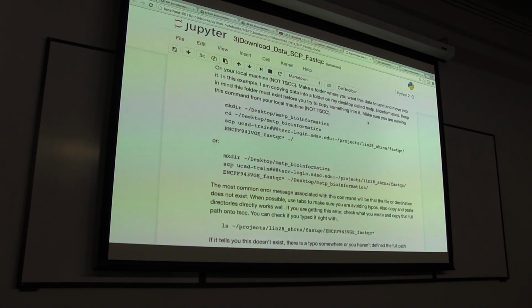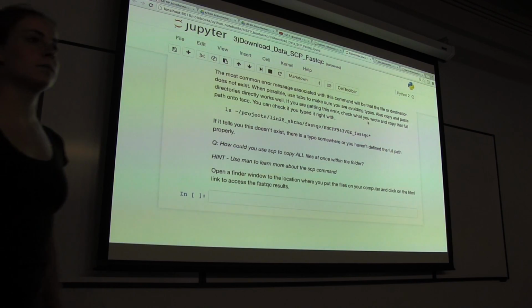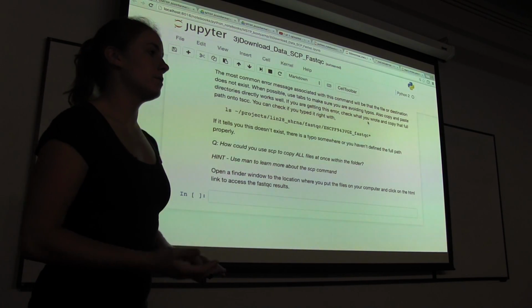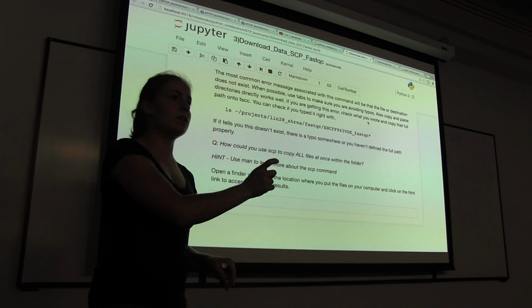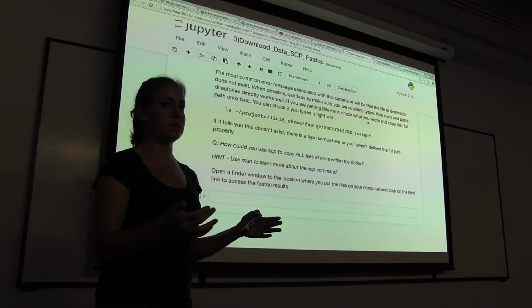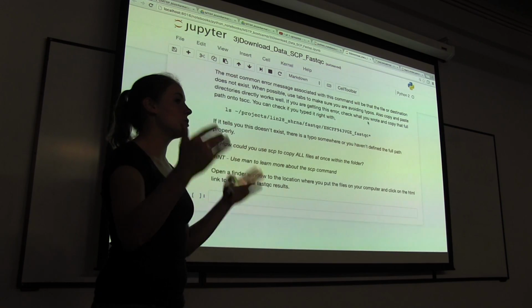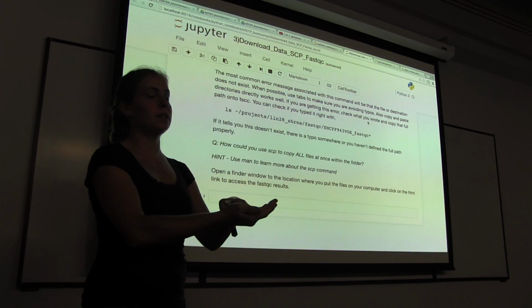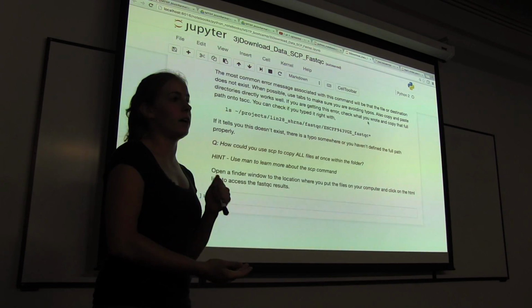One more question? Yep. When the adapters are turned off. Yes, so Illumina does that for you when they give you the sequence. Remember in the FASTQ file we saw the sequence that was the index read. So what they give you off the machine is the clean trimmed sequences unique to that index. And again, they'll trim the index off for you. So for all of the sequences associated with that index, only the insert, your DNA piece, will be included in that file for you.